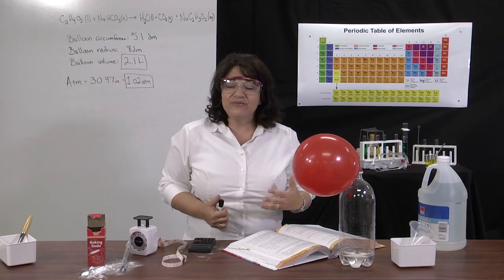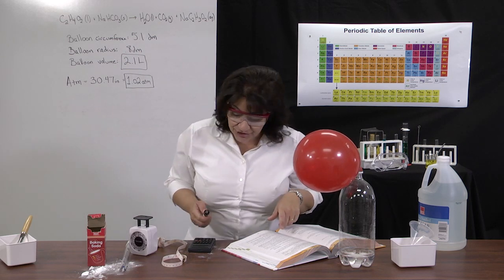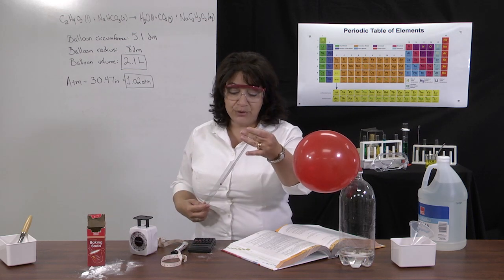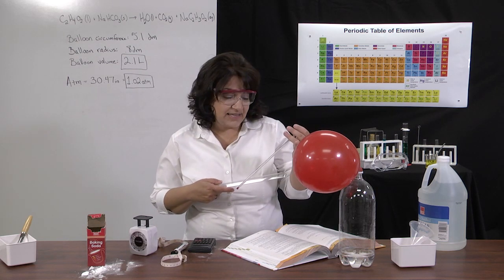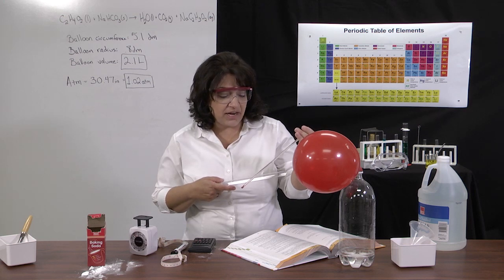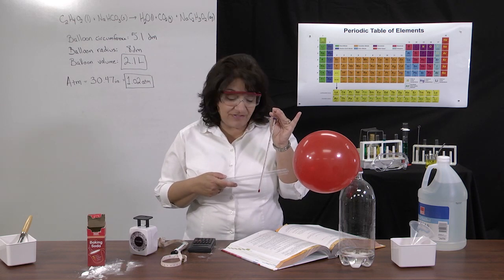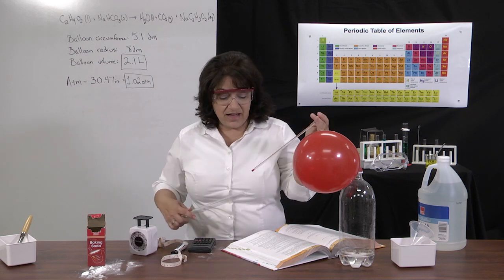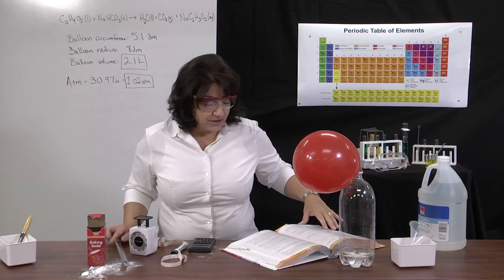To do that, we can determine what the vapor pressure of the air is in our environment right now. We need to know the temperature, so I'm going to use my thermometer, which has been sitting out for a while, so it's at room temperature. My thermometer is measuring 21, and it's right on the dot, 21.1 degrees Celsius. Now I can look at the table in your text, table 11.2, to determine the vapor pressure at this temperature. I'm going to look at my table.